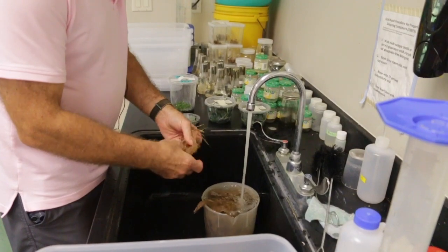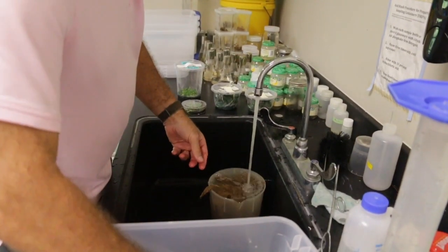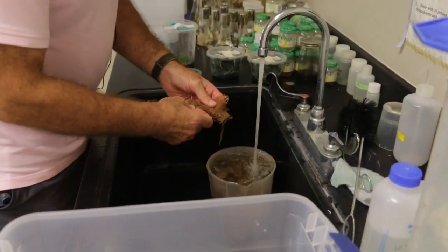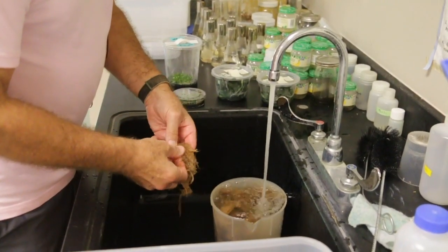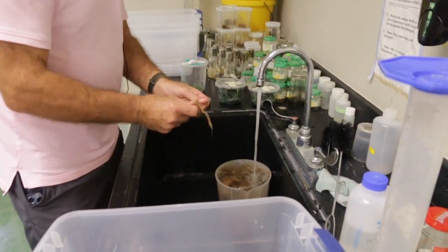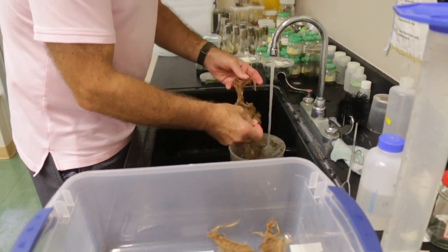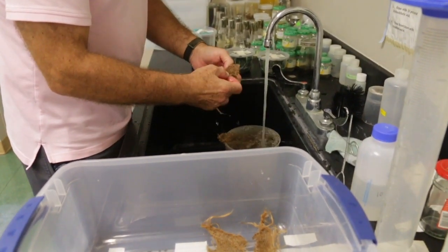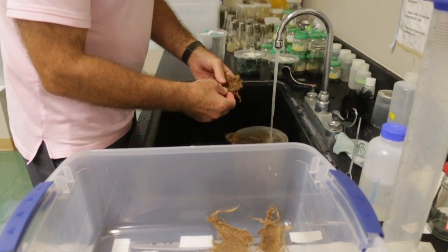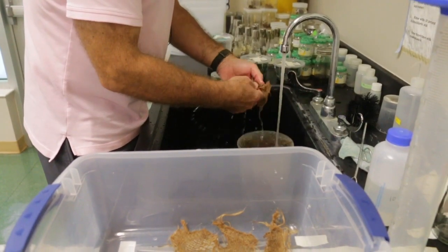Today I'm in the laboratory and we're going to be doing some burlap orchids. I've really liked doing this in the past. I've had some really nice successes with both the orchid growth after deflasking onto the burlap and even survival of some of these orchids in the trees. So what I want to share with you again is how I prepare these burlap orchids, and we're going to be doing some new ones today.